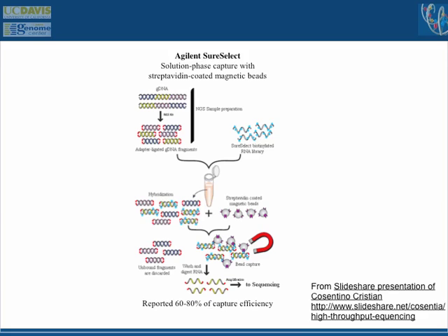There's no doubt that right now sequencing for many projects is cheaper than sample prep. All the machinations that you do with sample prep and PCR and pooling together samples and extracting DNA and tracking them and doing voucher specimens and all these other things, the sequencing is now the cheap part.